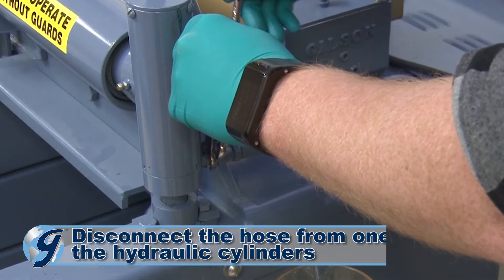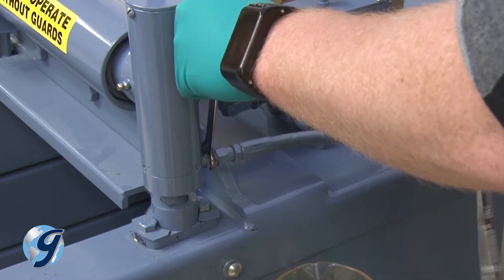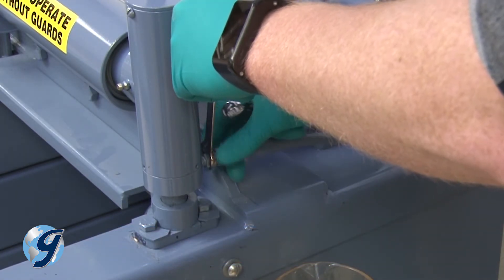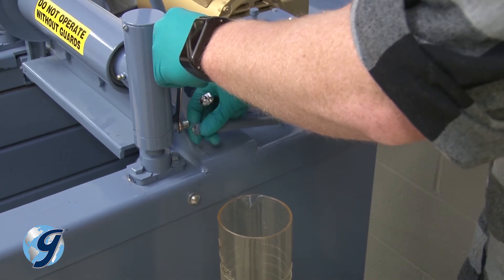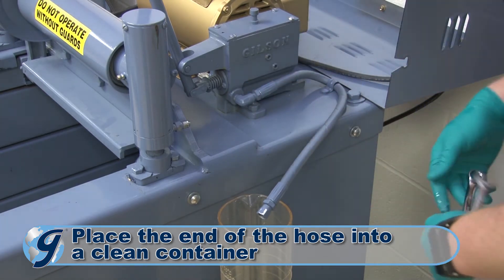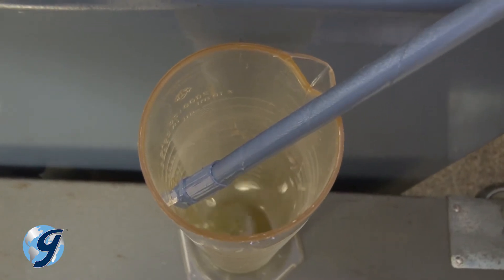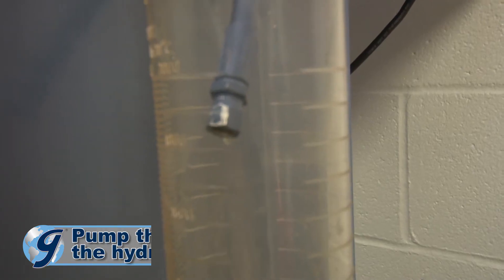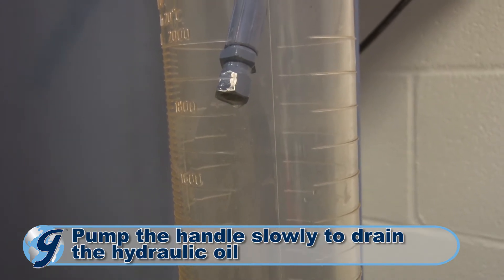Next, drain the pump system of hydraulic oil by disconnecting the hose from one of the hydraulic cylinders, leaving the other end of the hose connected to the pump. Place the free end of the hose into a clean container at a level that will allow gravity to empty the system of hydraulic oil. Pump the pump handle slowly to drain the hydraulic oil from the system.